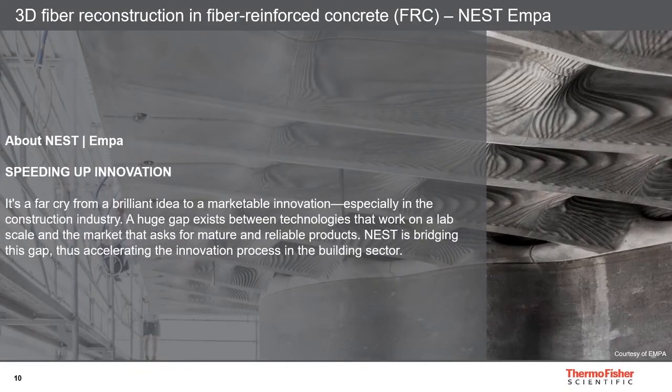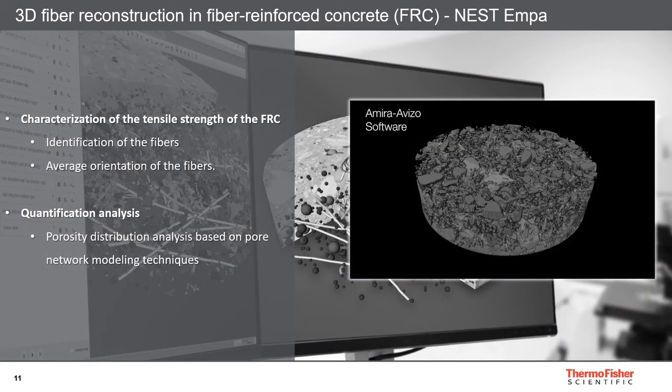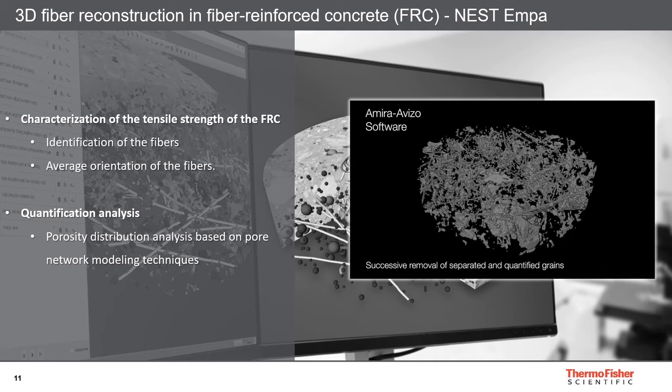Fibers are used in concrete to increase its structural integrity. The characteristics of fiber-reinforced concrete change with varying fiber materials, geometries, distributions, orientations, and densities. Avizo Software enables characterization of the tensile strength of the FRC by identifying the fibers and providing their average orientation.